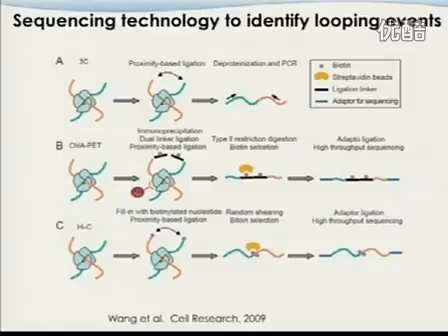Eventually, our collaborator changed the protocol to Hi-C, and that helped a lot. Still 97% of the reads are not usable, but we improved from 0.5% usable reads to 3%, which we are pretty happy about, right? So these technologies seem pretty straightforward, conceptually, but once you really do it, there's a lot of hassle to go through. And I think this is what I'm going to talk about today for the epigenetics part.